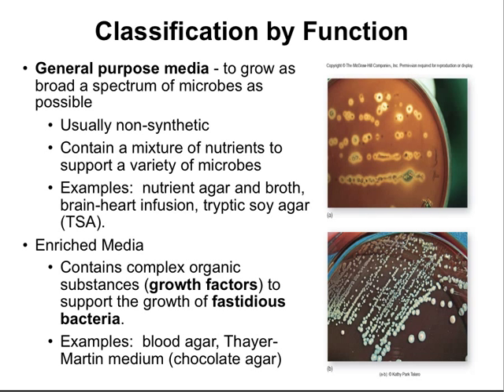Another type of function is enriched media. These media are going to support the growth of particular fastidious bacteria. That is, bacteria that require special nutritional or environmental conditions. They contain complex organic substances or growth factors that support the growth of these, let's say, picky bacteria.